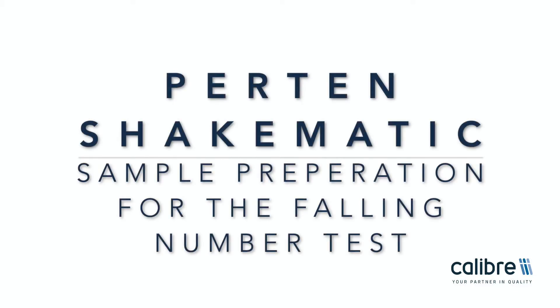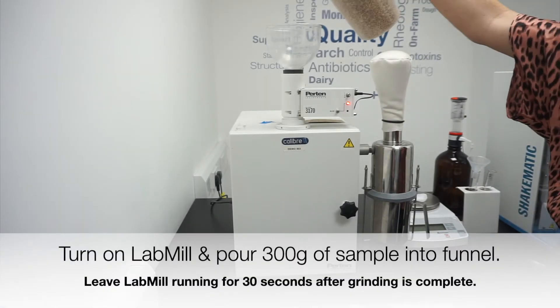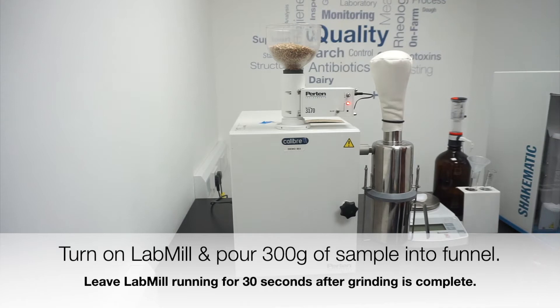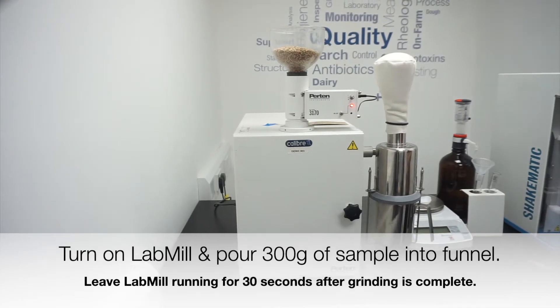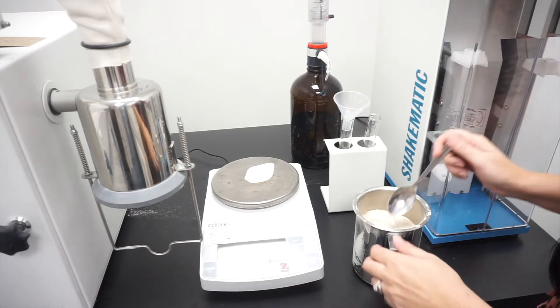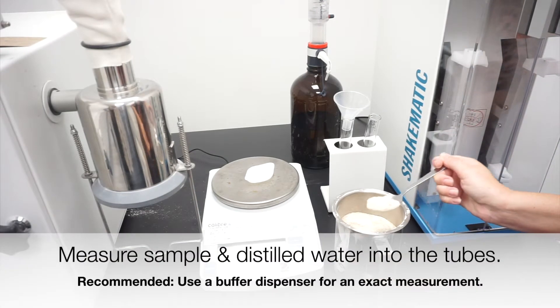The Shakematic from Perton speeds up sample preparation time, improving consistency and repeatability of results for your falling number test. The Shakematic will mix a homogeneous sample every time regardless of operator. This video will show you how simple it is to use.